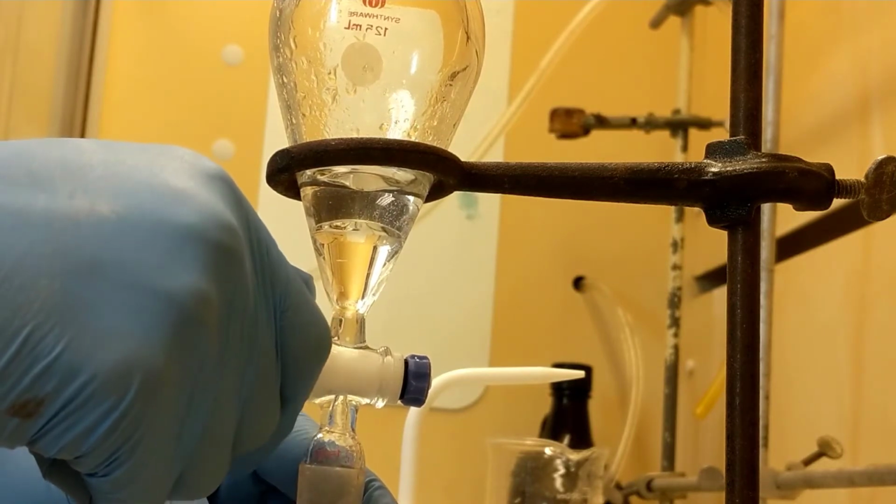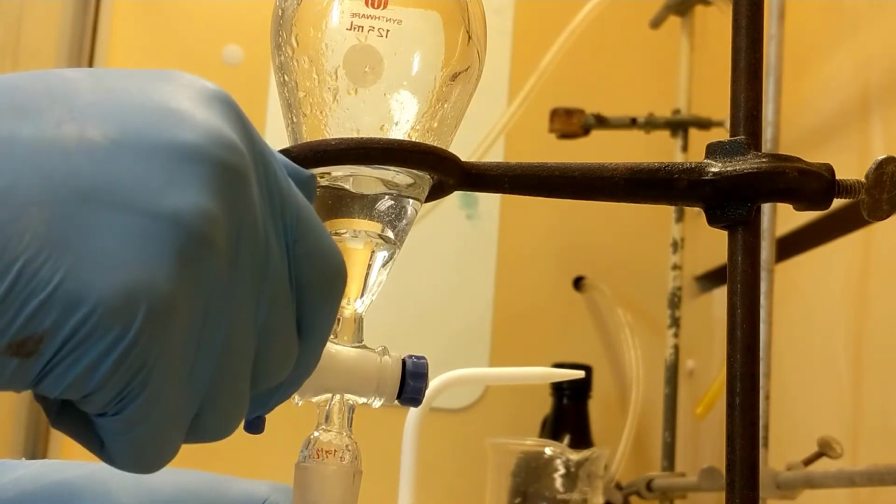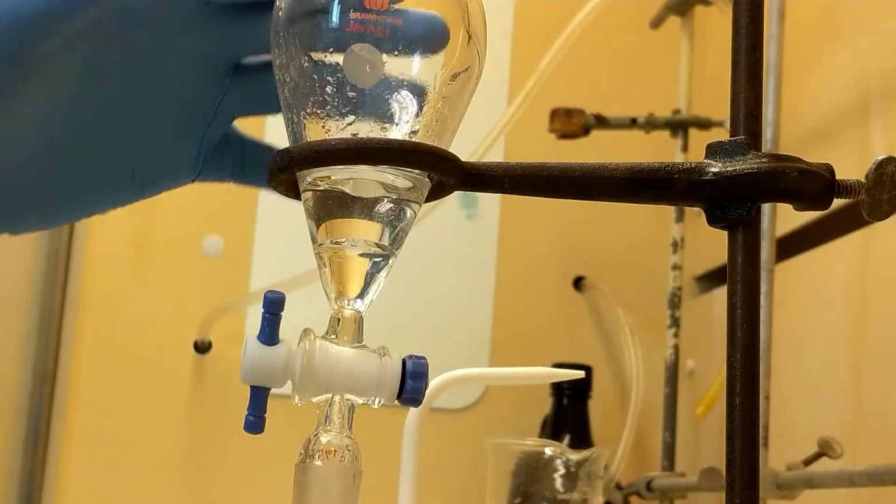Watch the line move down. It's going to move slowly. You see it right here? Moving down, down, down the separatory funnel.